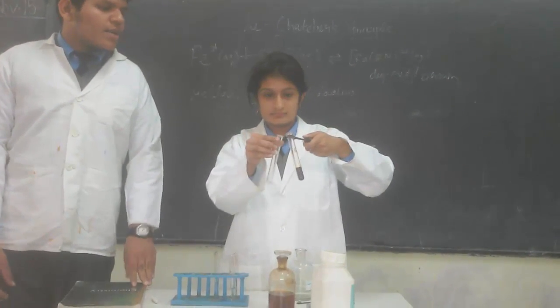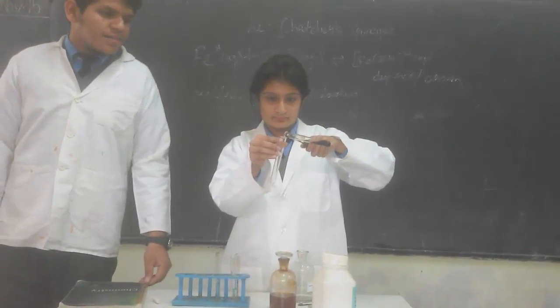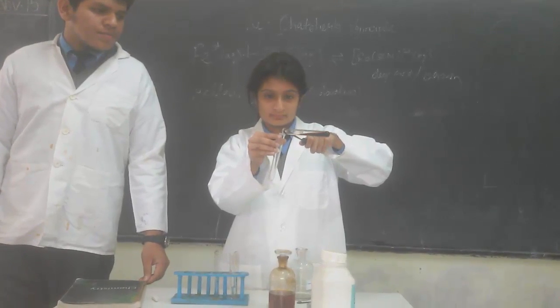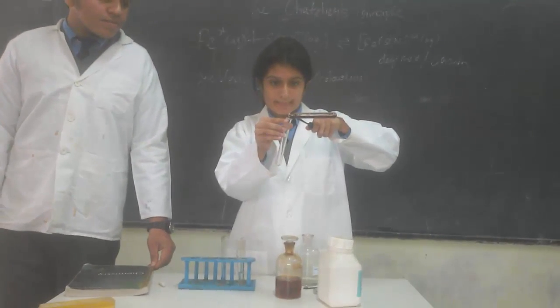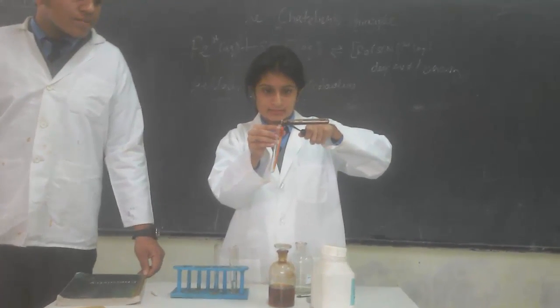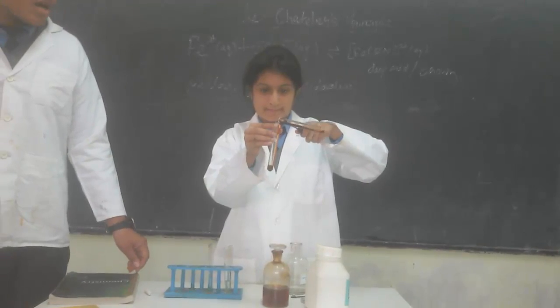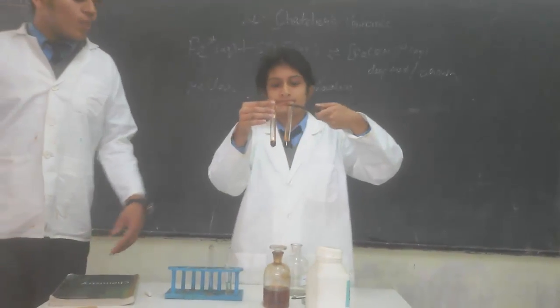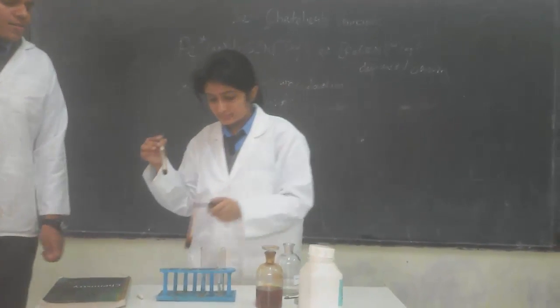Now we will divide it into different parts. To one part we will add Oxalic Acid.